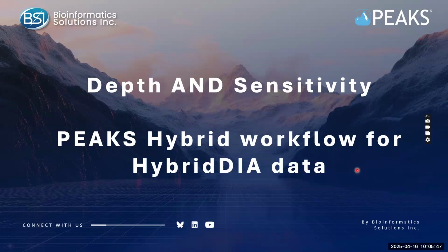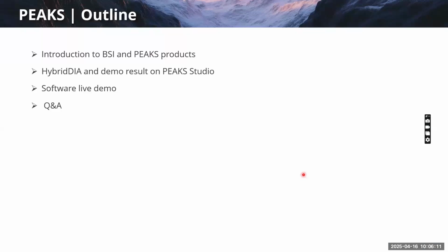So first, welcome everyone to today's webinar. Today we will introduce Peaks. We have a workflow we call the hybrid workflow for the hybrid DIA data from Thermo Fisher and Professor Olsen's group. So this is the outline. At first, I will do a short introduction to BSI and our Peaks product.